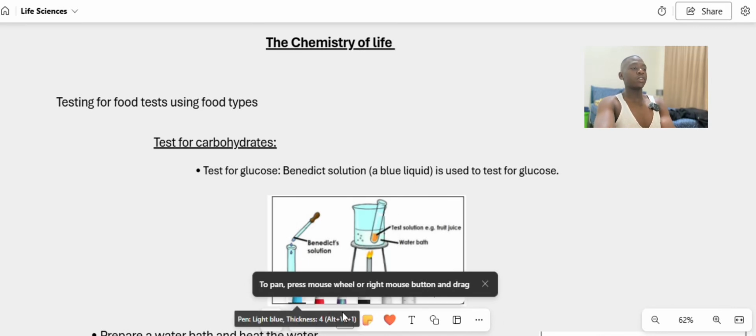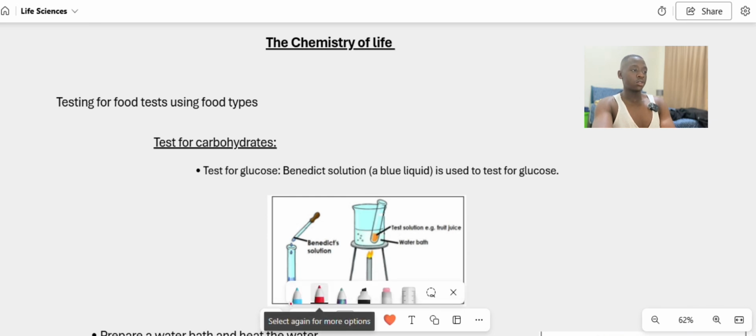Today we're on the topic of the chemistry of life, grade 10 life sciences. In the last video, we covered the topic of organic compounds and inorganic compounds. This time we're going to cover the food tests using food types, such as the testing of carbohydrates, lipids, and proteins. We're going to start with the test for carbohydrates.